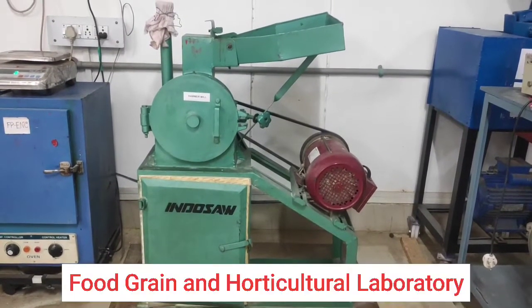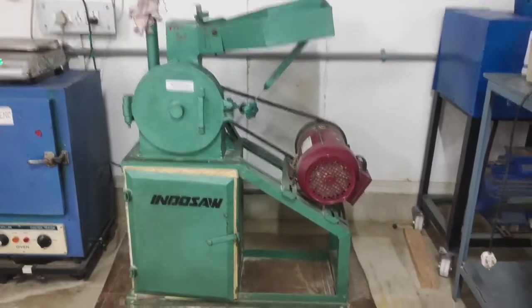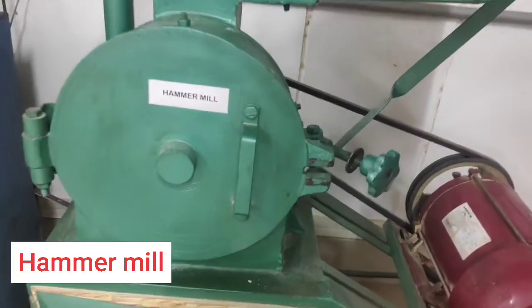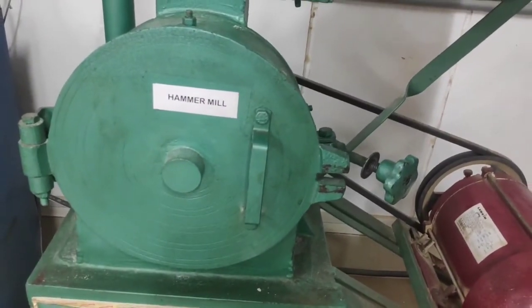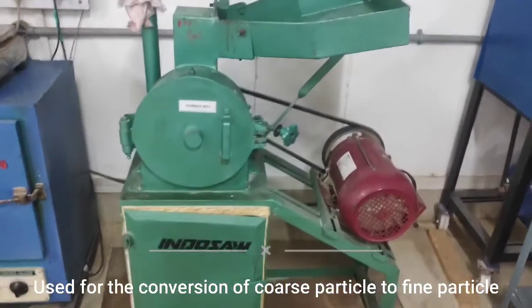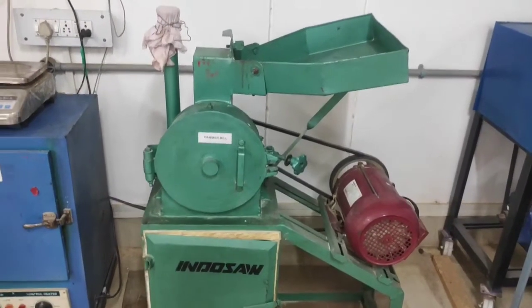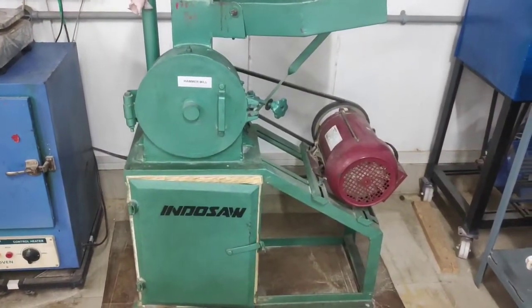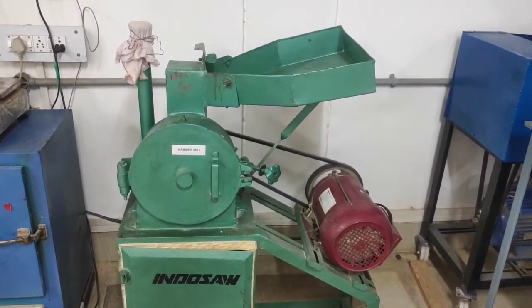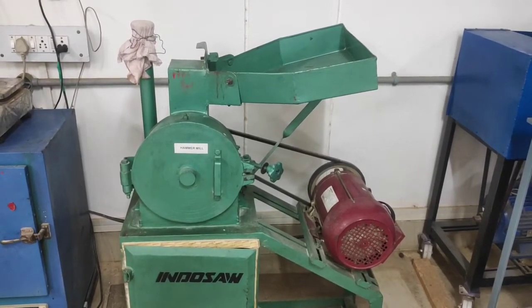Welcome to the food grain and horticultural processing laboratory. In today's experiment we are going to evaluate the performance of a hammer mill. A hammer mill is a type of mill used for the conversion of coarse particles to fine particles. Size reduction can be done easily using a hammer mill, and the name itself suggests that it has a set of hammers to reduce the particle size of food material.